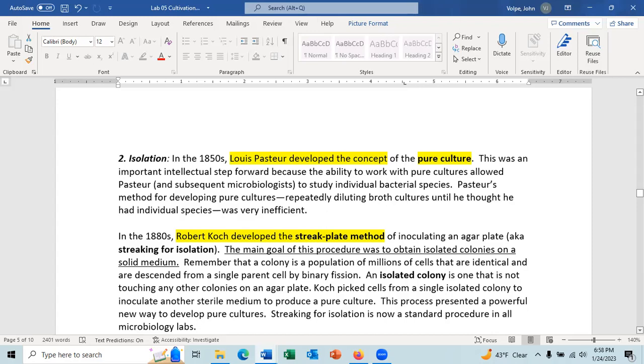And if you get another isolated colony, you can use the cells from that isolated colony that went through 2 isolated colonies, meaning it was purified 2 times, and then you're greater than 95% chance that you have a pure culture. If you only go through 1 colony streaking, your chance of getting a pure culture is only about 70%. And that's just not good enough in microbiology.